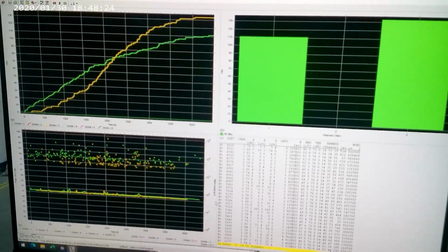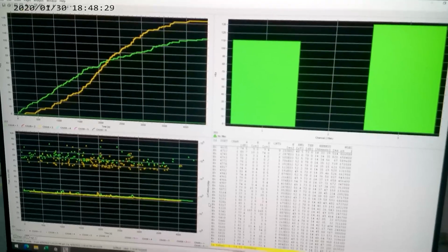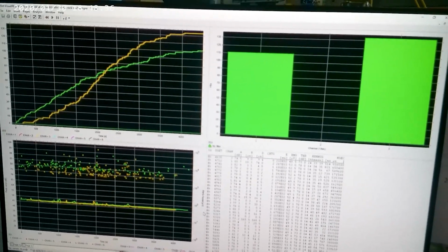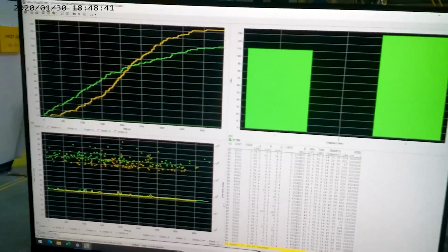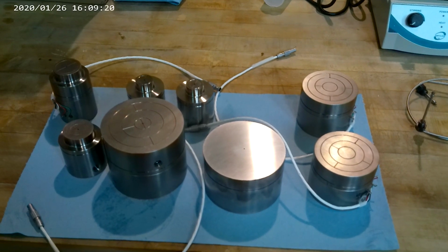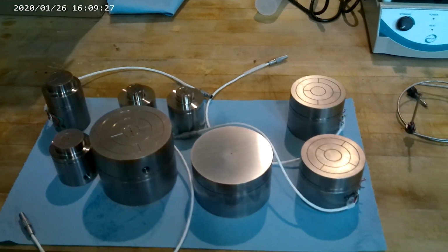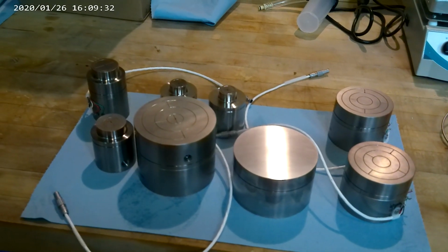Unlike conventional triaxial equipment, a prismatic specimen can be loaded in one transverse principal stress direction with flat jacks using the vessel wall as a reaction force, while the other lower transverse principal stress direction is pressurized with a confining fluid. The system has a maximum axial loading of 3,560 kN or 800 kips, capable of testing most rock and hard materials with diameters from 25 mm to 100 mm or 1 inch to 4 inches.